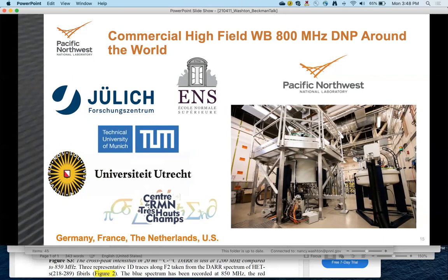I'm really thrilled and proud to have that system. It's amazing, although we haven't really hit the ground running yet. And so there is another 800 megahertz system in Bob Griffin's lab, and he's done a lot of development and custom items with that, but it's not commercially available.